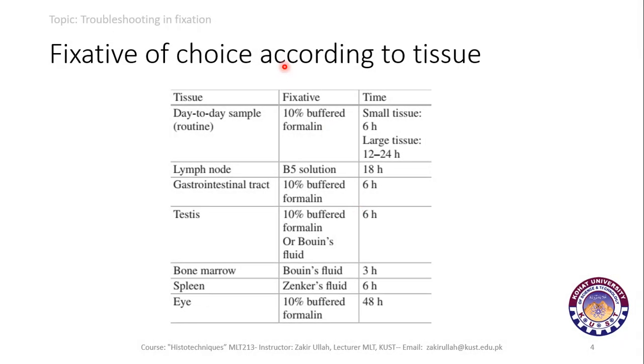Now, the choice of fixative according to the tissue type. These are the list of tissues, the fixative and the time for which processing is performed.